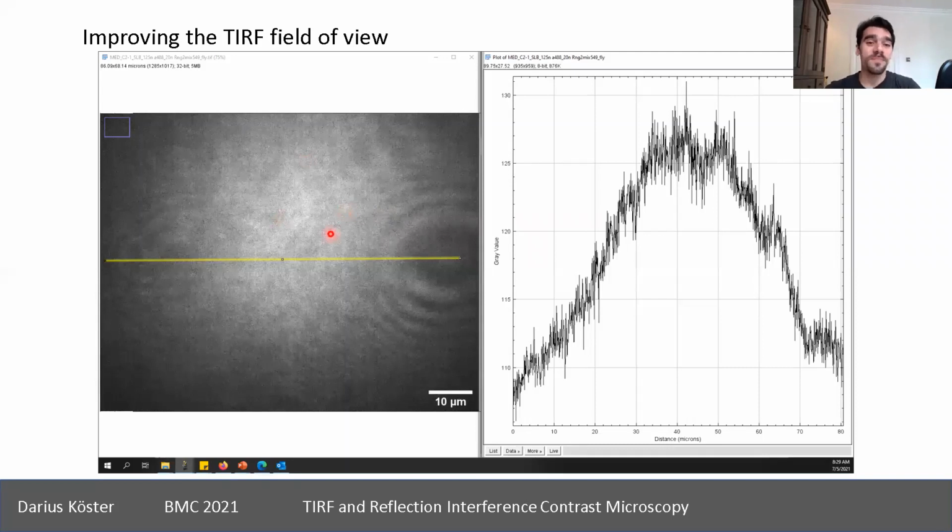But there are also other ways to check it. But anyway, just to give you an idea about the limitations of TIRF. First of all, you see there's this funny freckle here, and you get these spots. That can happen either when there are little bubbles still in the path, or in this case, we have just a laser fiber where, I have to admit, we don't really know exactly where this spot is, but it's part of the microscope.